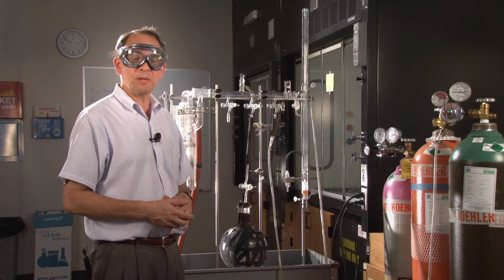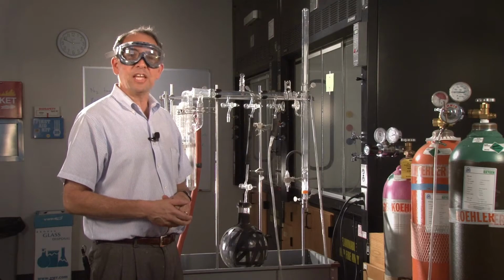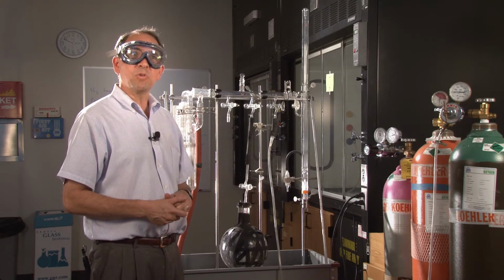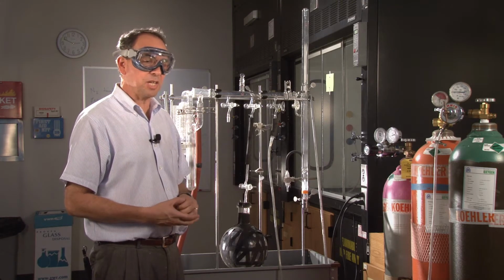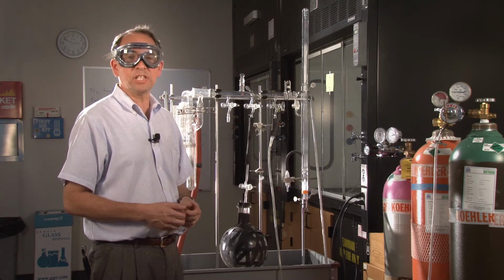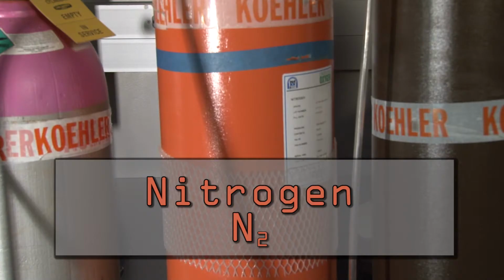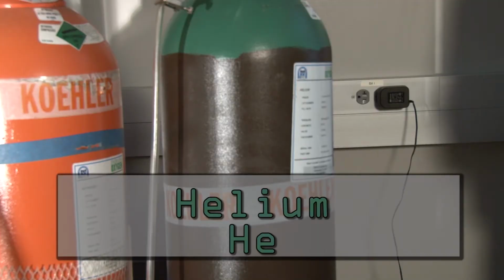Today we're going to be attempting to verify Avogadro's hypothesis. Equal volumes of gas at equal conditions of pressure and temperature will have the same number of gas particles in them. By gas particles, I mean molecules in the case of molecular gases like CO2 and nitrogen, and atoms when it comes to an atomic gas like helium.